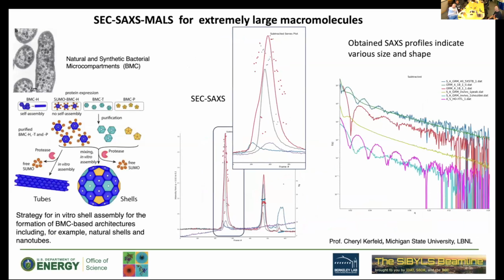So in the first peak, there's wide variation of Rg. Yes. So the Rg is off. Is this because the particles are so big, the Guinier region is so small? The Guinier regions are so small. A good point. This is something we see, and yes, it drives me crazy. If you go into the aggregates and the Guinier regions are only a few points, you can't rely on the Rg across the elution peak. That's a good point. This is completely off. The Rg values are wrong.